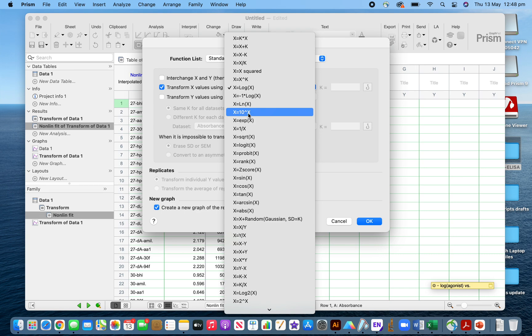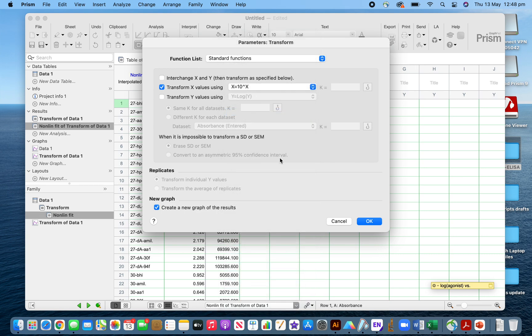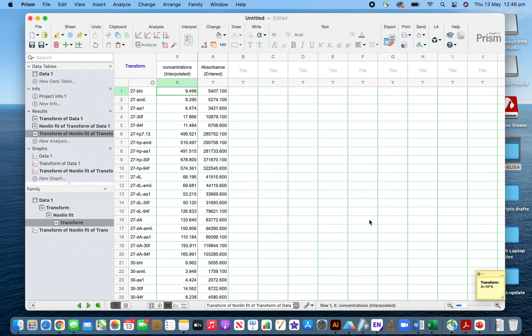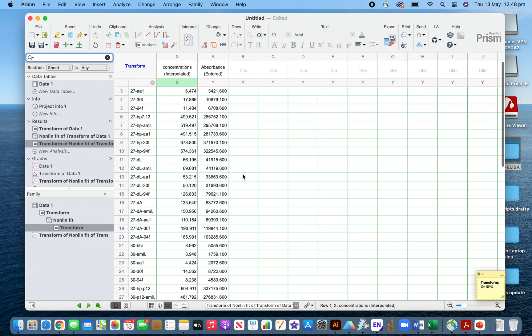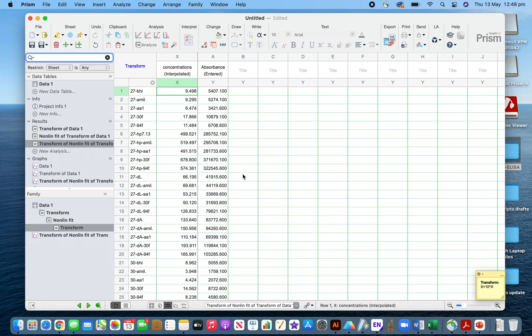Go to transform x using 10 to the power x. This is the anti-log. Go to the curve. This is the original concentration you're looking for. This is the method by which you can calculate your unknown sample concentrations.